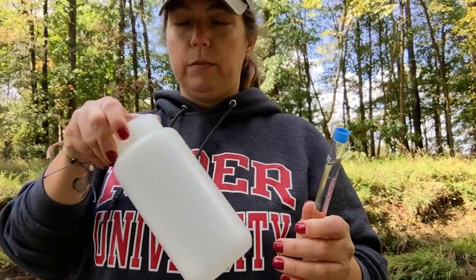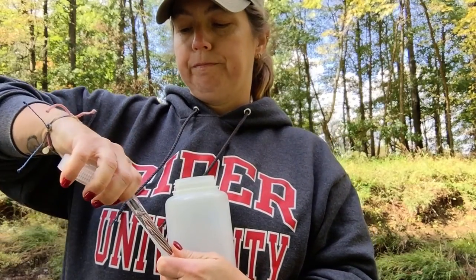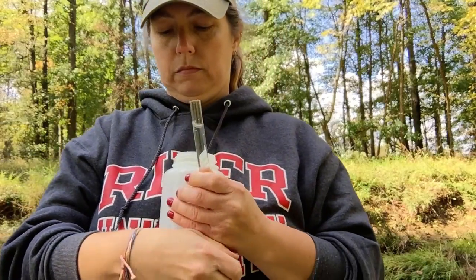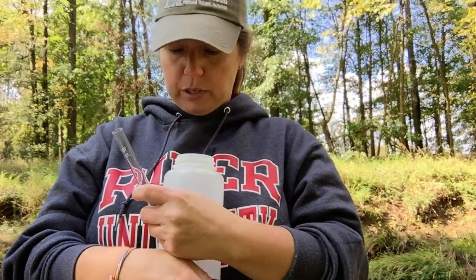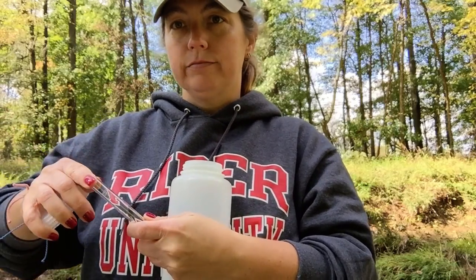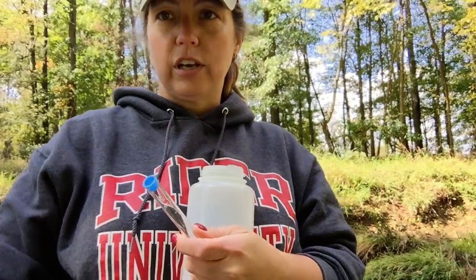We don't dump this in the creek because it's got all those chemicals in it. So I have a bunch of waste — I would have had a bunch of waste bottles for you guys. You dump it in the waste bottle and then I'm going to get rid of this at some point. So that's phosphate, and next is nitrate.